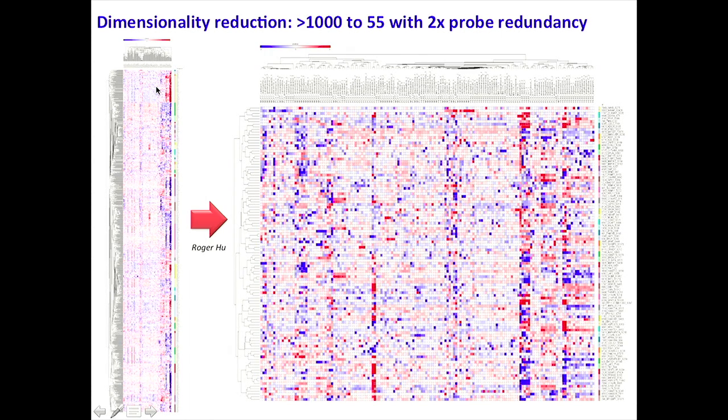And the way that we got there was by collecting a lot of traditional proteomics data, shotgun proteomics data. We took 3 different cell lines. We treated them with 26 different drugs in biological duplicate. We did this weeks apart and had a giant data set, 156 different samples, which was, of course, wholly, as I described earlier, lots of holes in the data. But importantly, there were over 1,000 sites, maybe between 1,000 and 1,500 sites, that we could see in at least 3/4 of the samples that we profiled. So this is a good place to start.